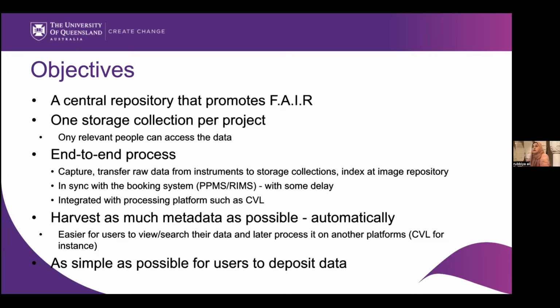So the good point about Pitschi is we offered automated harvest of metadata. The file is dropped in the storage collections, and then it automatically reads all the metadata and stores it in the Pitschi database.